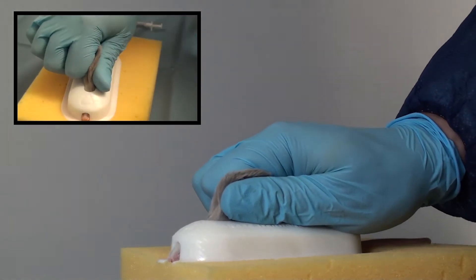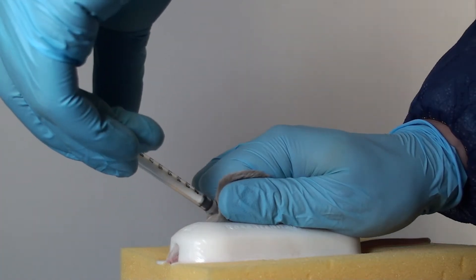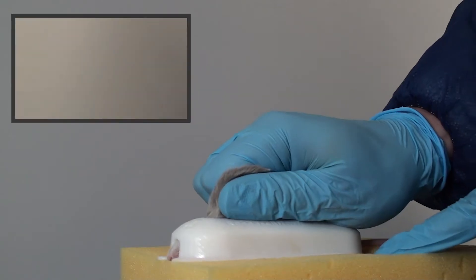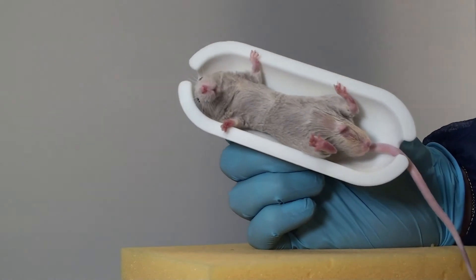The ScruffGuard is ideal for routine subcutaneous dosing such as pain relief following surgery or microchipping for identification purposes. The ScruffGuard can also be used for intraperitoneal procedures.